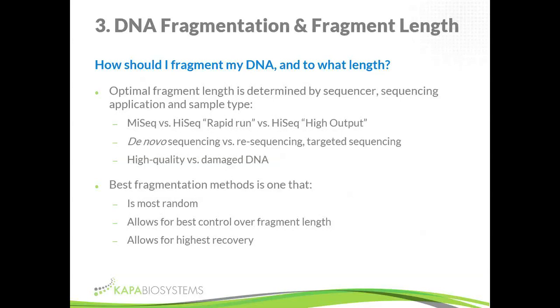And then throughput's important. Everybody's doing more and more and more sequencing. And so when you pick a method, performance is always more important than convenience.